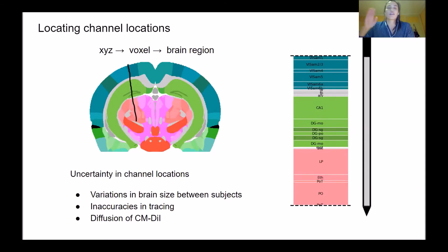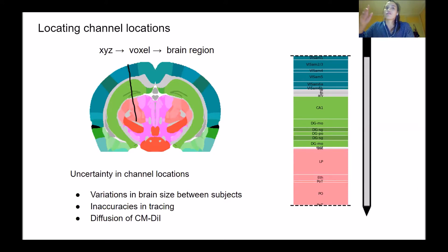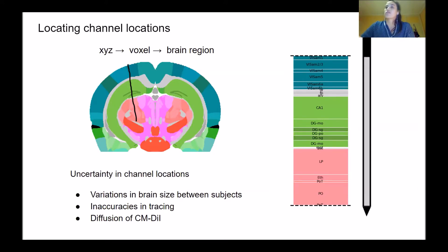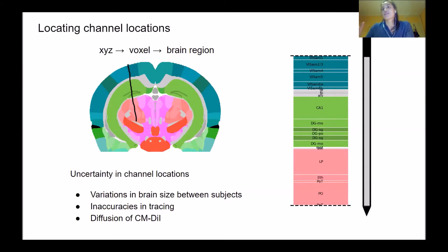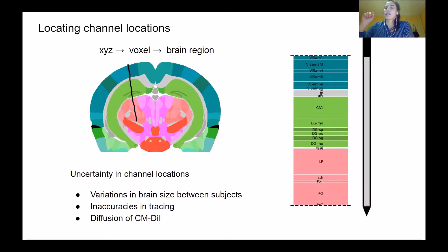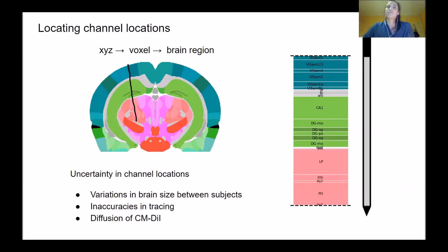When we're tracing the track, you notice in the last images the fluorescent trace can be quite broad and wide. There are obviously inaccuracies when tracing and locating the probe. This is also perpetuated by the fact that the dye can sometimes diffuse to nearby brain regions, so you have uncertainty in knowing exactly where your probe was located.